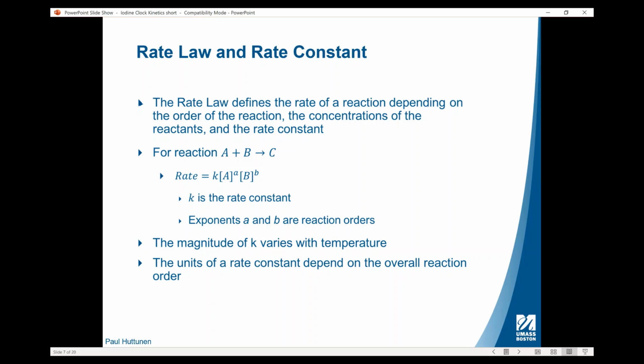So in today's lab, we will be figuring out what the rate of the reaction is. We will also be determining what the order of that reaction is. So is it concentration dependent or not? And then we will also be able to determine what the rate constant is.